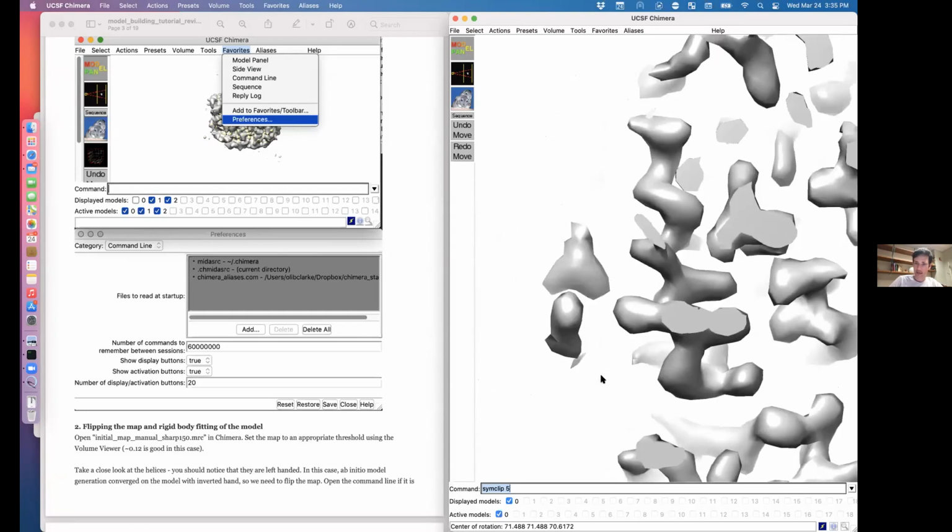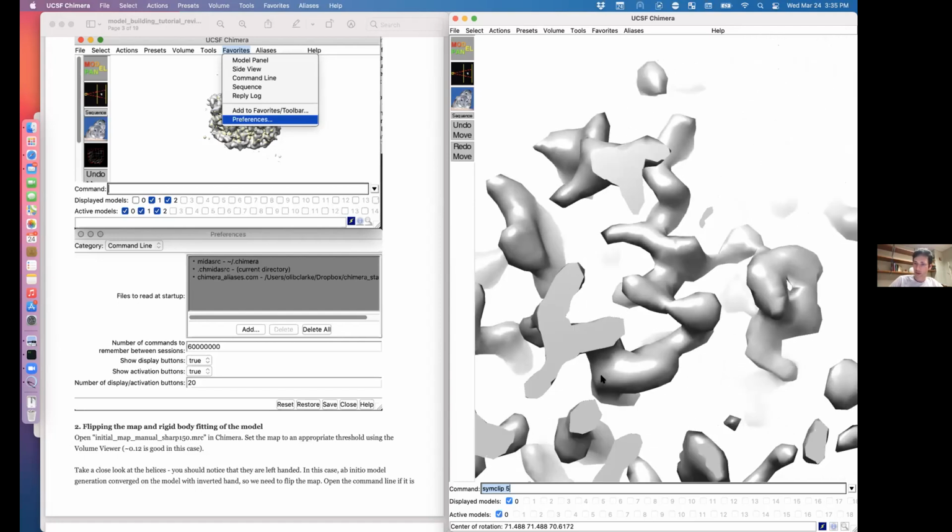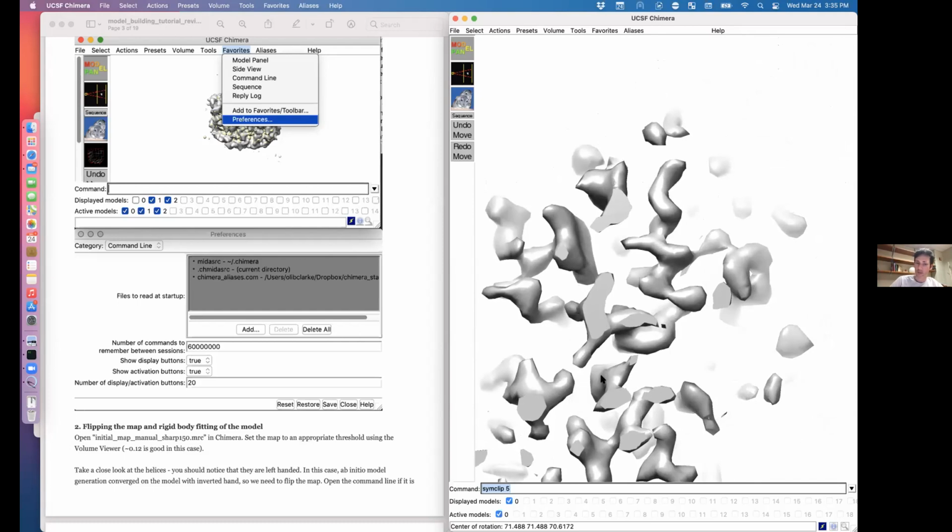Now, if you have a look at this helix, you should be able to tell off the bat that something's not quite right, because this helix is left-handed, right? And that is something that you will encounter all the time during ab initio structure determination, because there's an equal probability that you're going to converge on the inverse versus the correct hand.